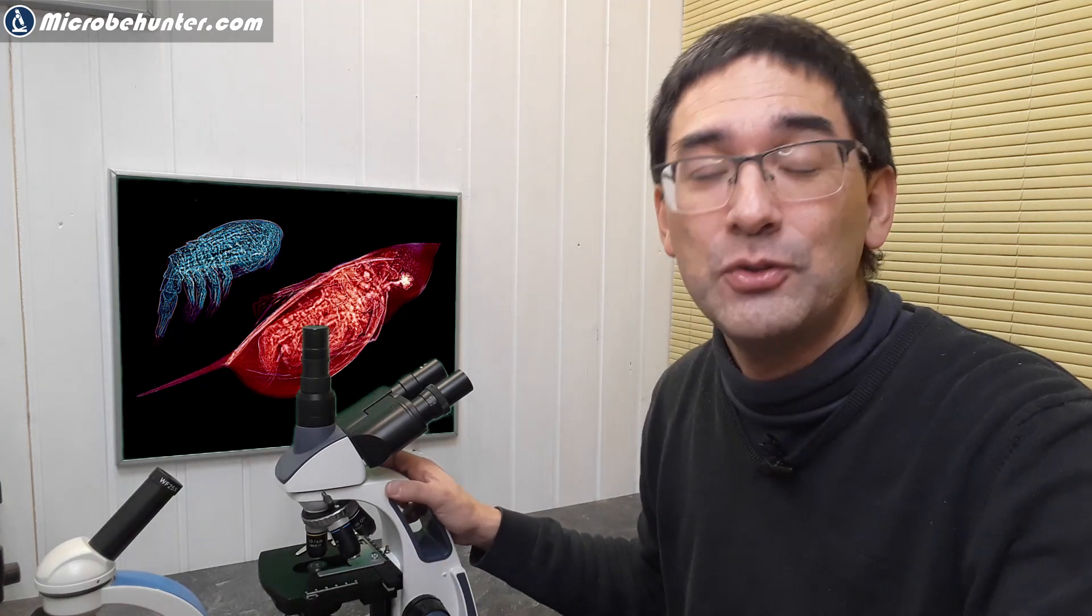But you see, if you look through a research microscope, an expensive research microscope that they use in pathology, in medicine and research at universities, then you probably don't want to look through those anymore here either because the field of view is still larger. It gives you even a yet more immersive impression. The optical quality is yet better. So you see, there is never an end. There's never an end. And what I would probably say is the following.